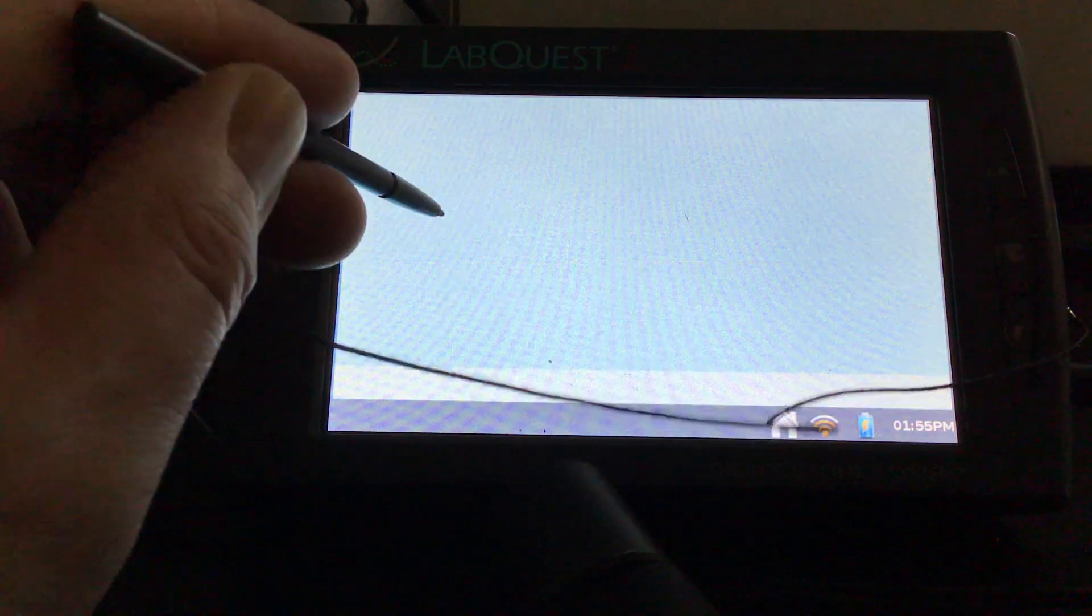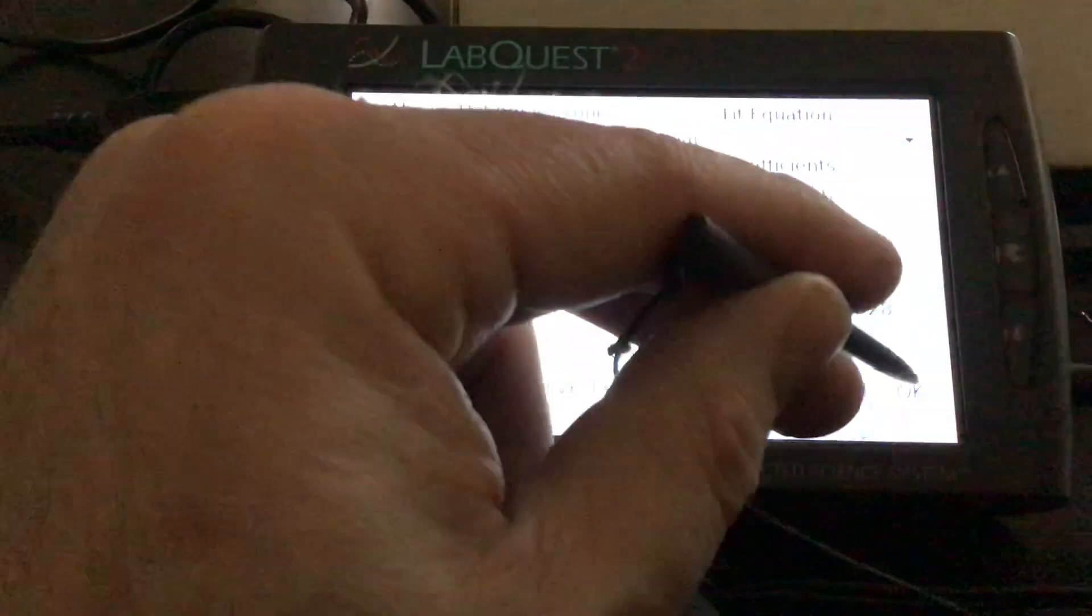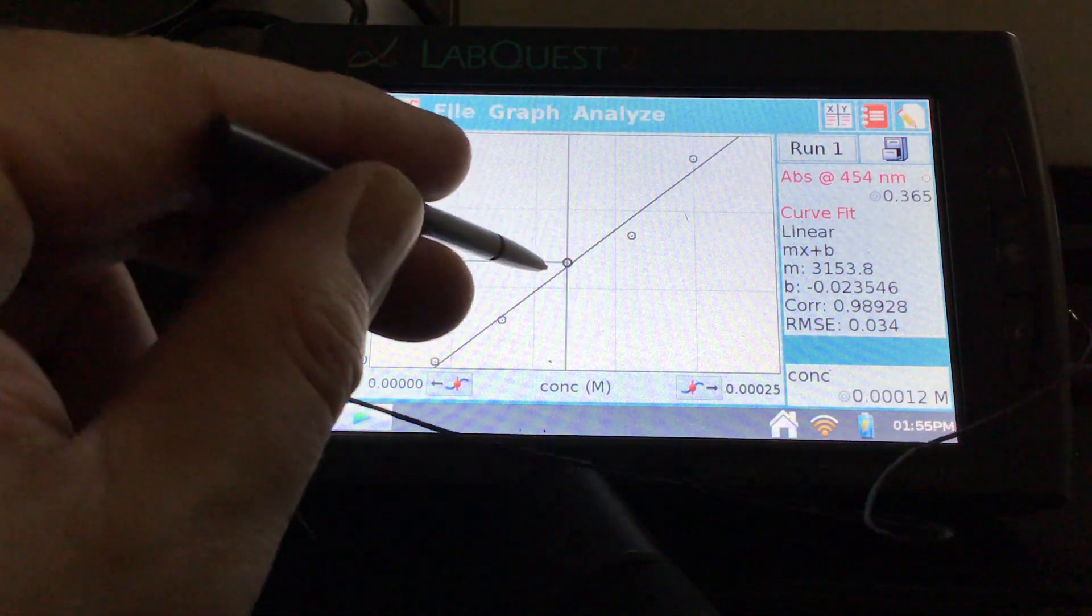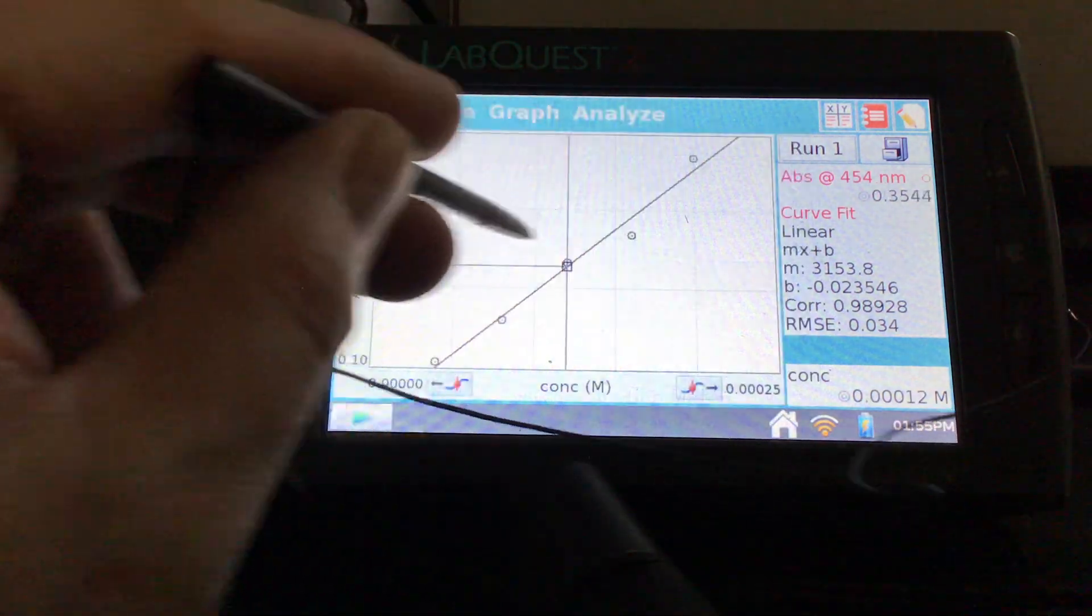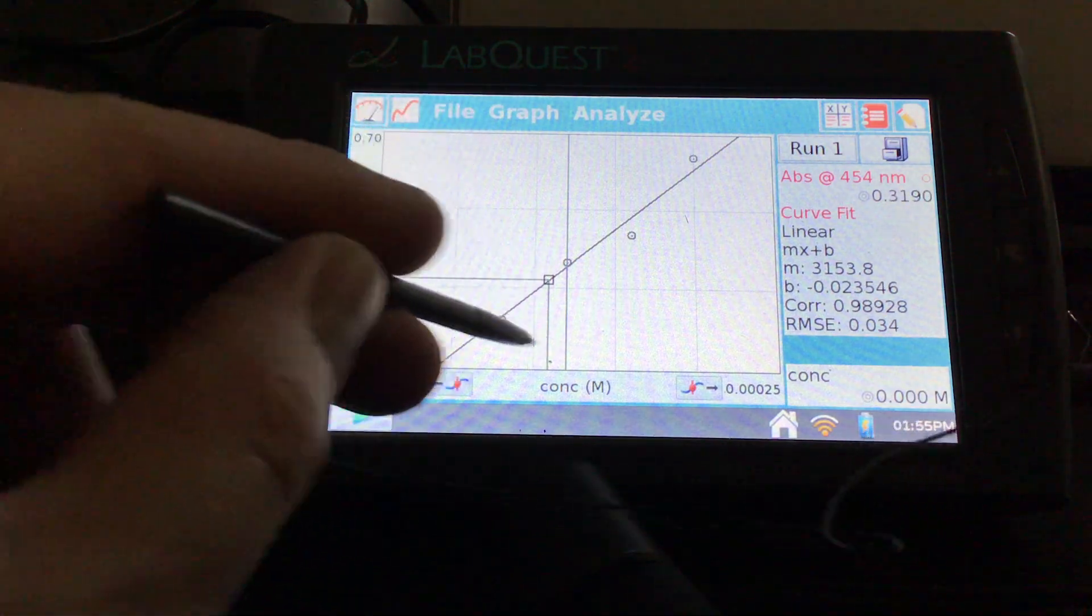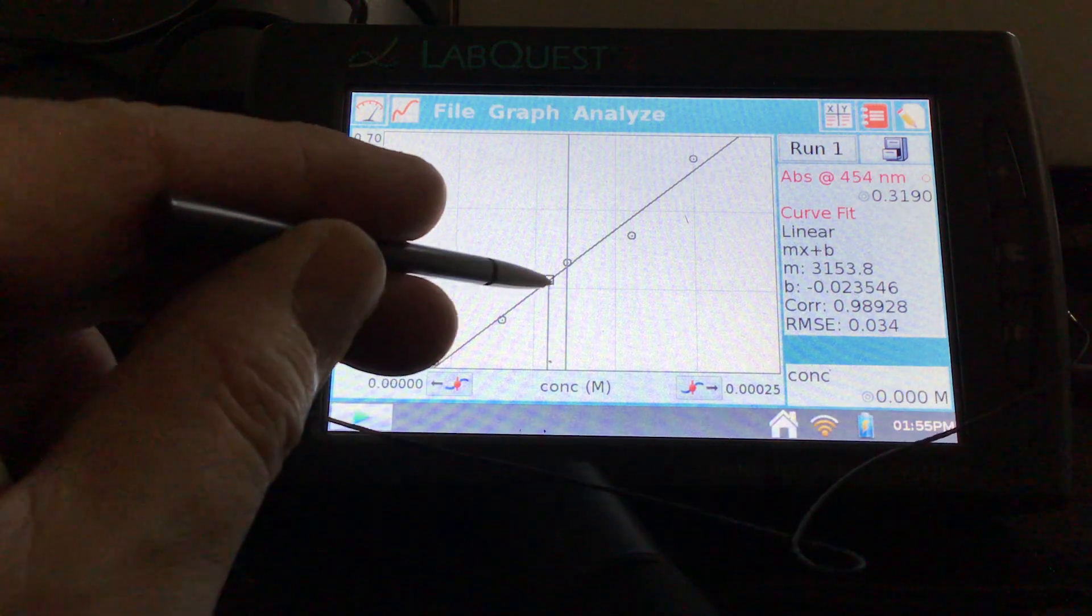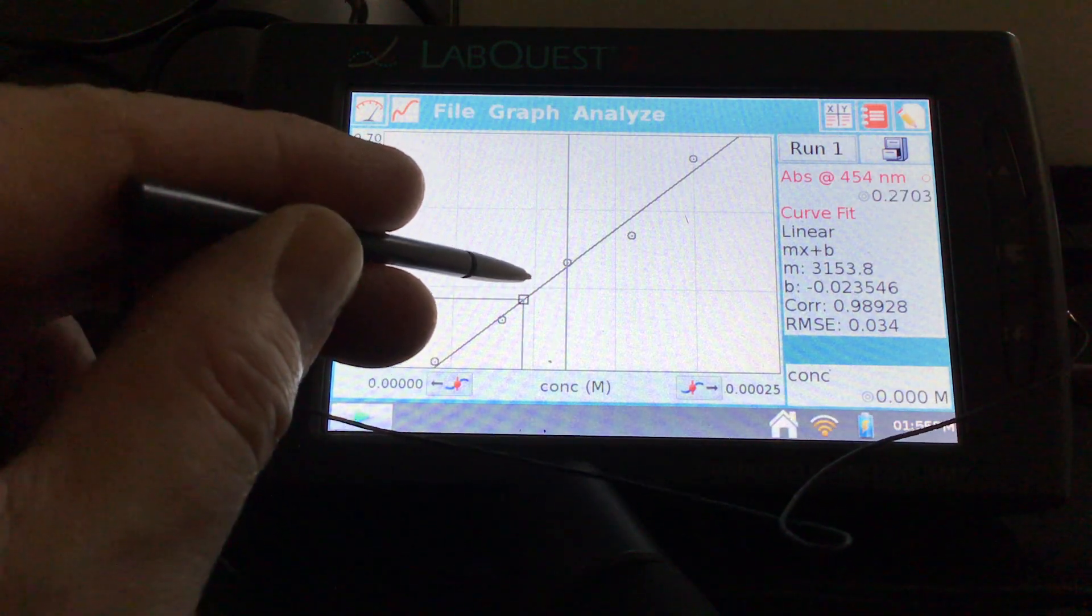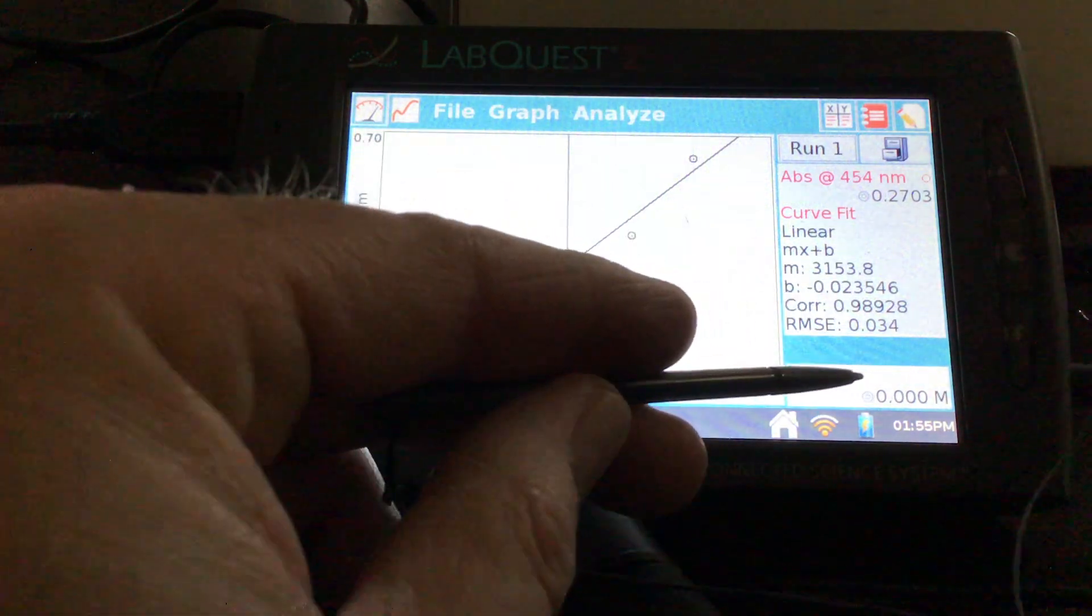So let's see. Let's try that one more time. Linear fit. And then we want to interpolate. Yeah, it's not showing the concentration. Very strange.